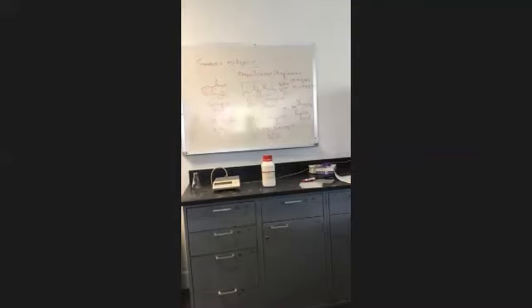Let that sit for about a minute. And then I can go ahead and pour this out so we can make the ice bath. Yep. Repurpose.